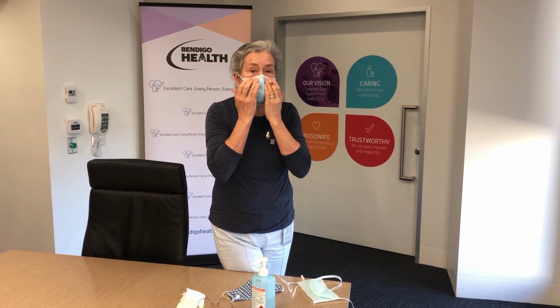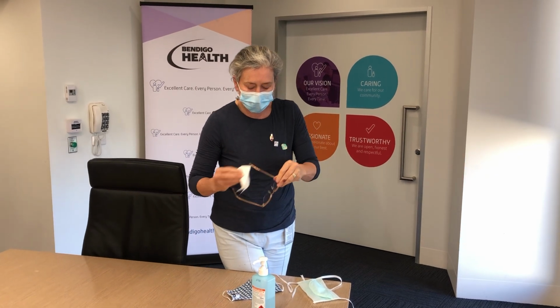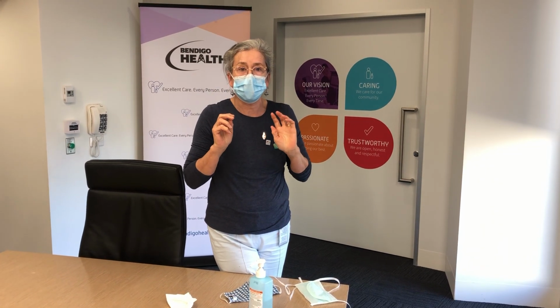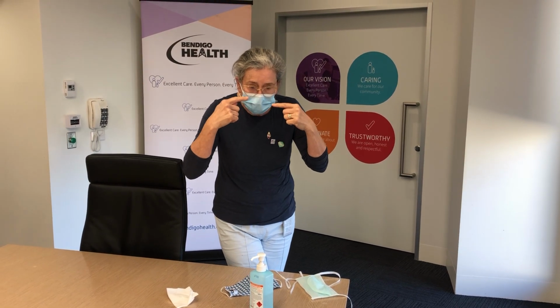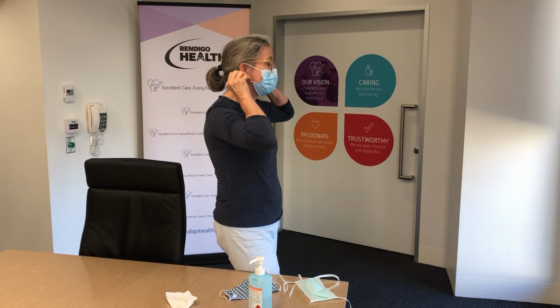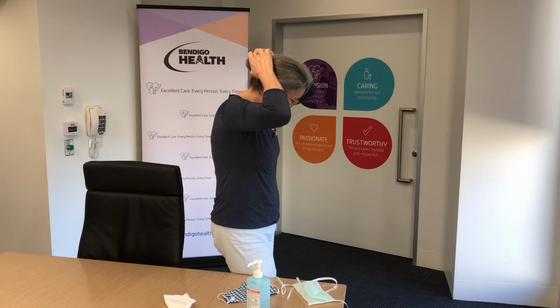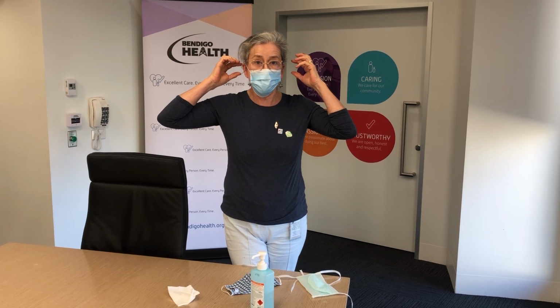Now, because my hands are clean, I fiddle around a bit at this point and then get my glasses back on my face. People do have some tricks around the way they're then going to stop them fogging up, but by and large it will clear even if it does fog up temporarily. So that it's closed underneath my chin, it's closed as much as it can be here. The issue is sometimes around the side, and some people are finding it easier to use a different fixator and pull them slightly tighter. If you've got a ponytail, that works, or there are clips that you can use.